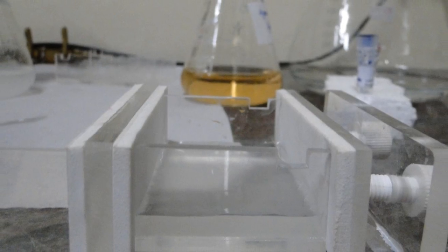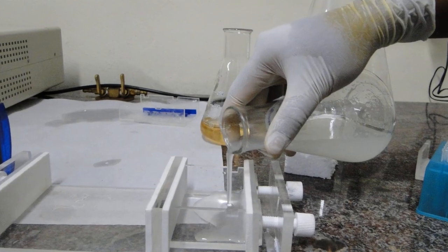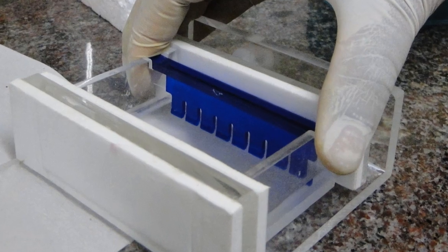Gel casting trays, which are available in a variety of sizes and composed of UV transparent plastic, and sample combs around which molten agarose is poured to form sample wells in the gel.